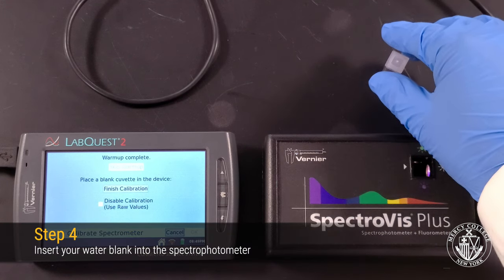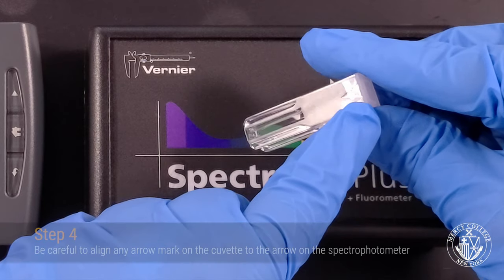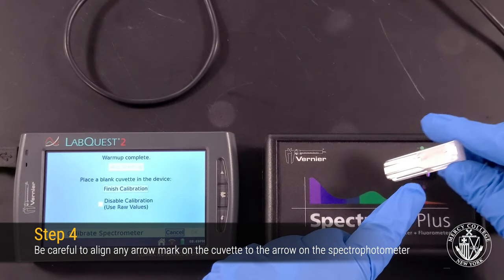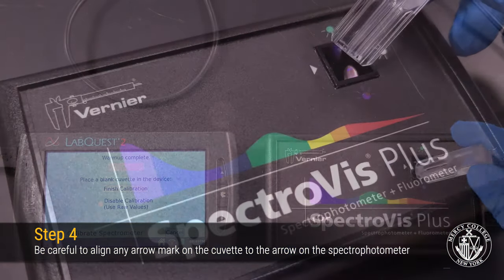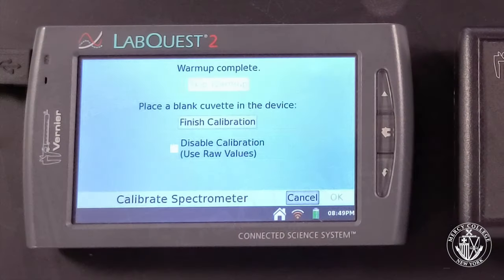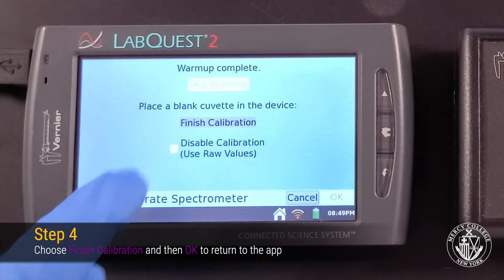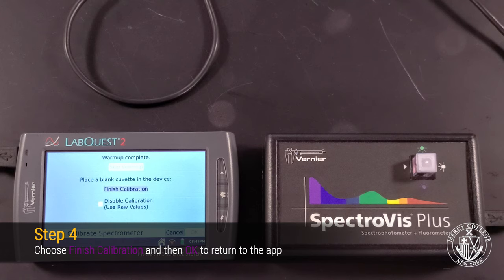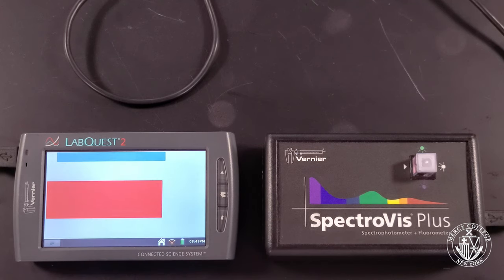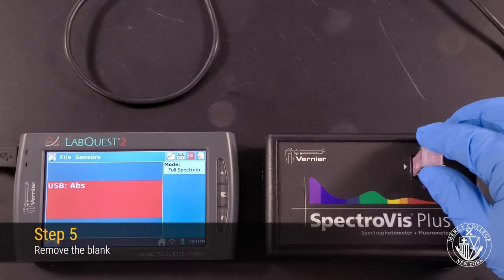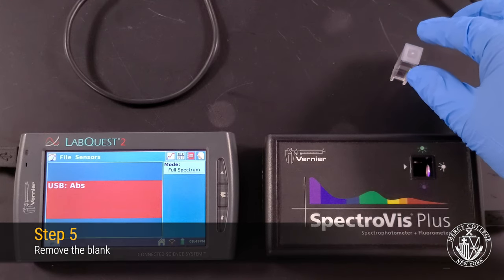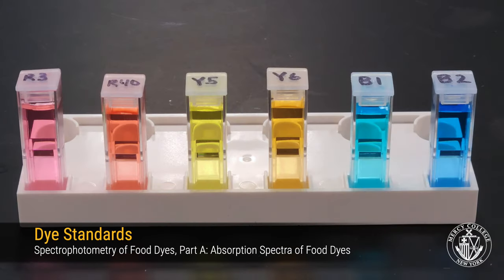To finish the calibration, insert your blank sample into the spectrophotometer, making sure that the arrow on the cuvette lines up with the arrow on the spectrophotometer. Now select Finish Calibration and then OK in order to complete the calibration of the spectrophotometer. Then remove the blank sample from your spectrophotometer. You're now ready to analyze your six dye standards.